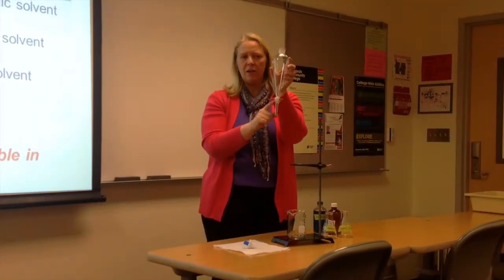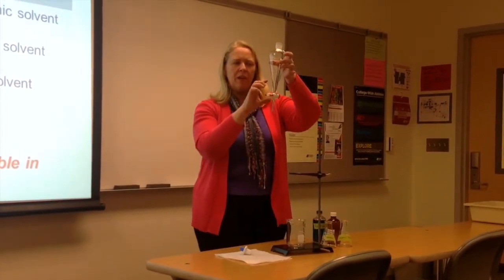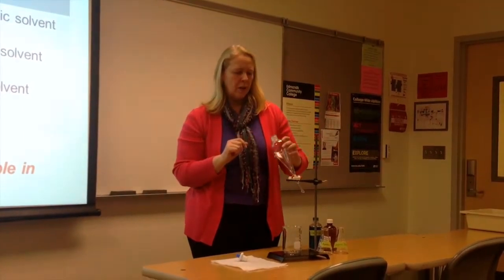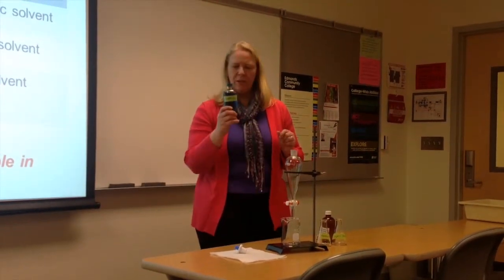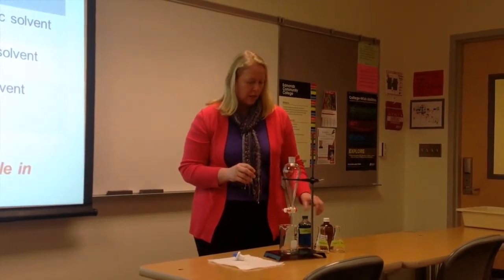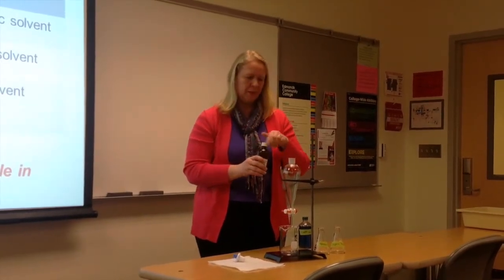It has a stopcock on the bottom, and we can put a stopper on top. And this is a great funnel from the shape where you can easily see 2 layers. So what I have prepared is actually sodium hydroxide solution. I put a little bit of dye in there so it's easier to see. And I brought some ether, so we'll just pretend that you dissolved your compound in the ether.